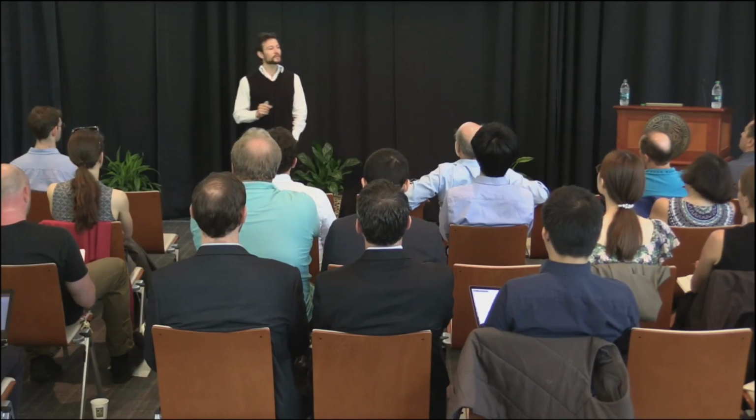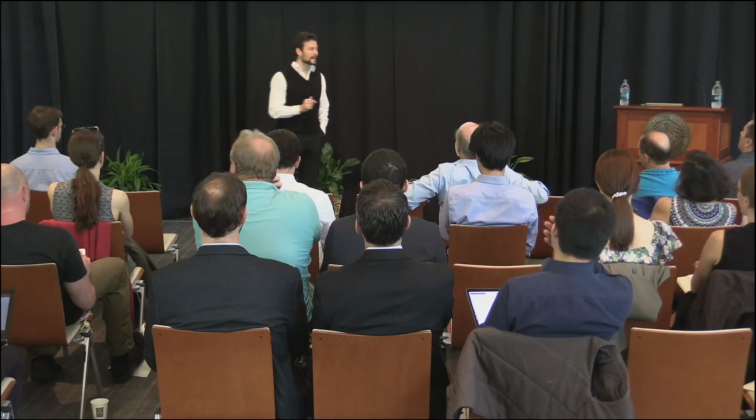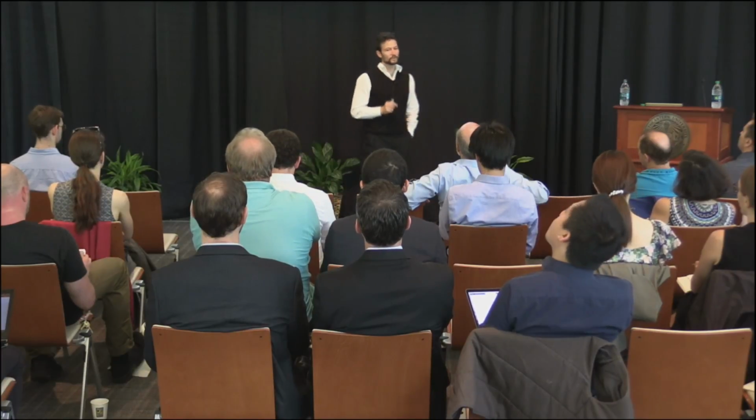And we not only want to deliver them, we want to deliver enough of them. Because if I had a mass spec instrument with perfect sensitivity, so that I identify every single ion that goes in and assign a sequence, that will be a detection device. It will not be a quantitation device. If we are counting single ions, we have to be counting hundreds of them so that we can obtain reasonable quantitation. So we not only want to deliver them, but we want to deliver them in as large an amount as possible. And that means we shouldn't lose them before they get there.